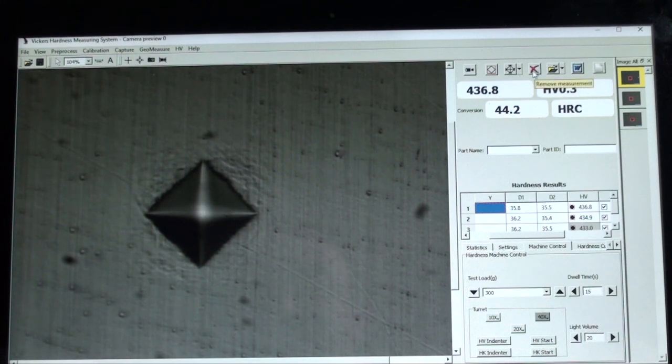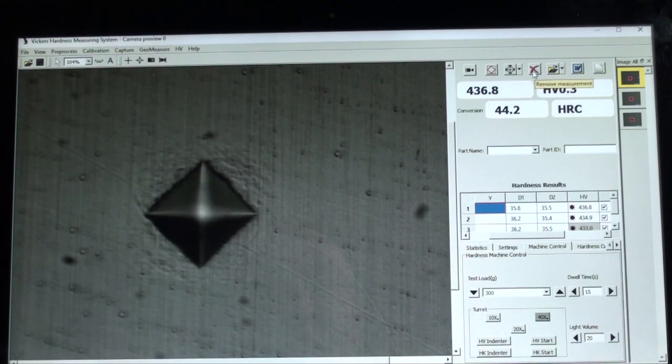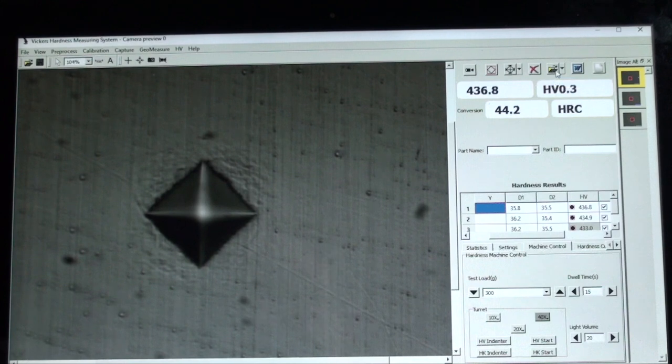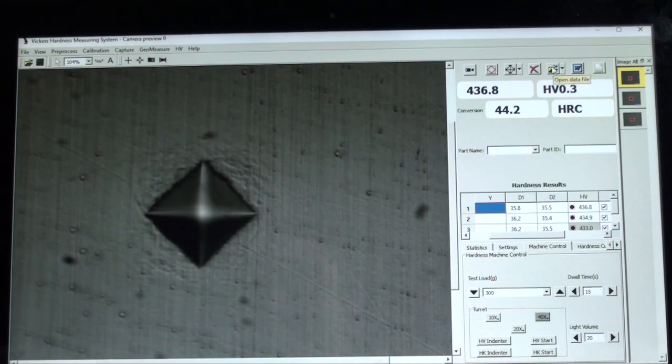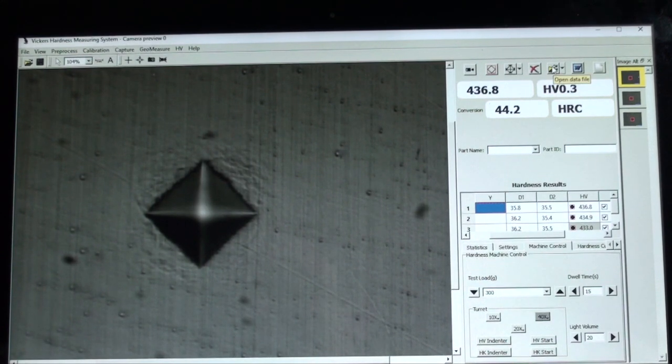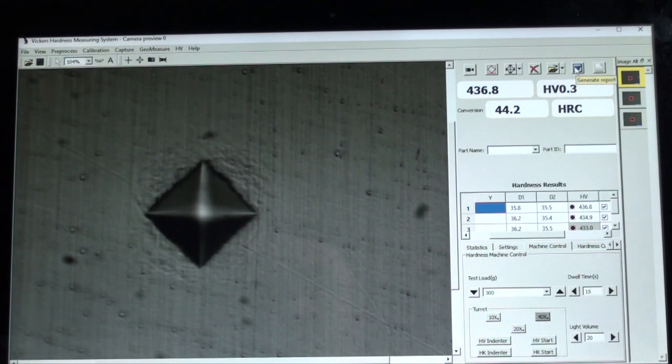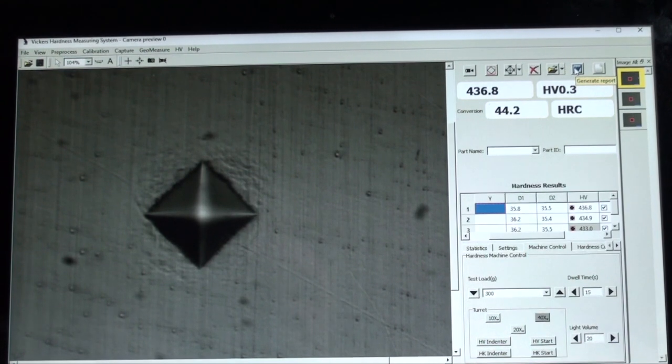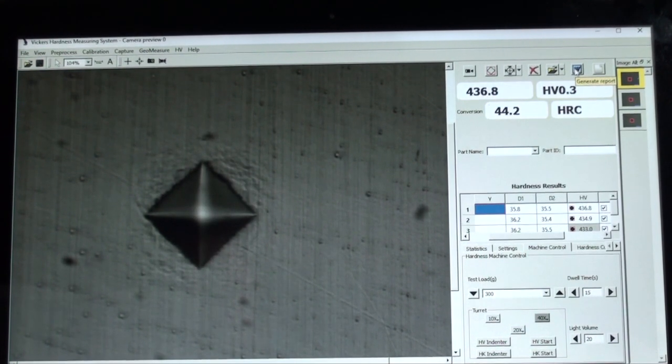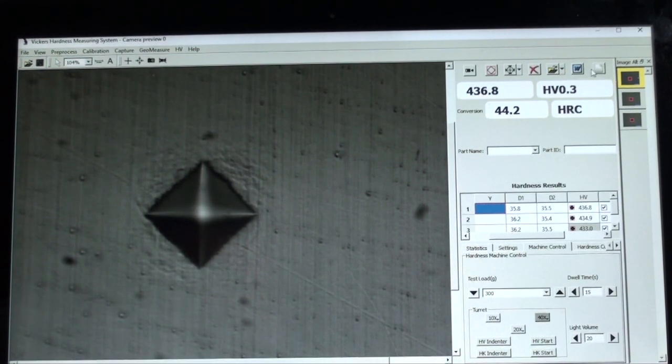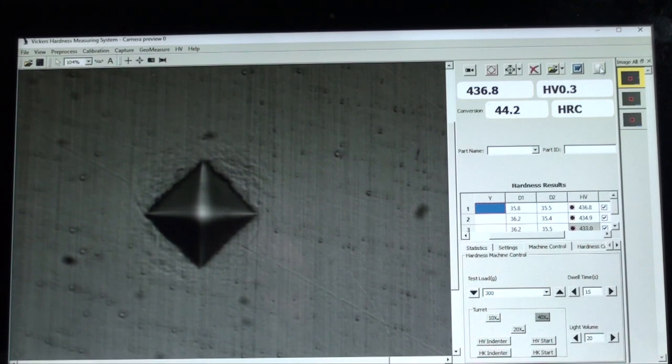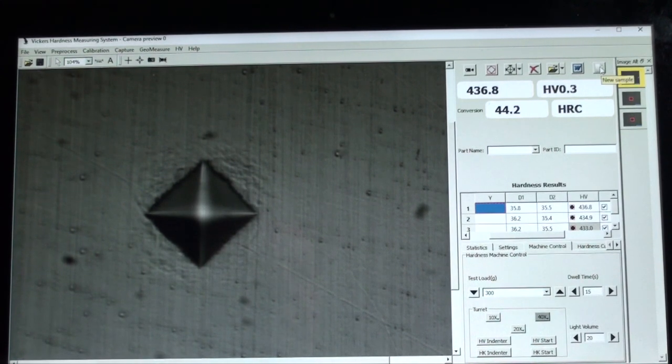Select data file locations. We can generate a report. We have image library and conversions.